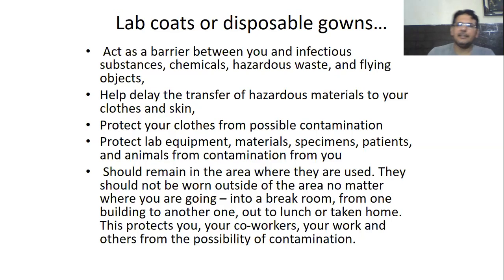That's why we should wear gloves, a mask, and a buttoned lab coat to protect ourselves and also to protect our experimentation. Lab coats help delay the transfer of hazardous material to your clothes and skin, protect your clothes from possible contamination, and protect lab equipment, materials, specimens, patients, and animals from contamination from you. They should remain in the area where they are used — not worn outside, whether you are going to a break room, from one building to another, out to lunch, or going home. This protects you, your co-workers, your work, and your clothes from the possibility of contamination.